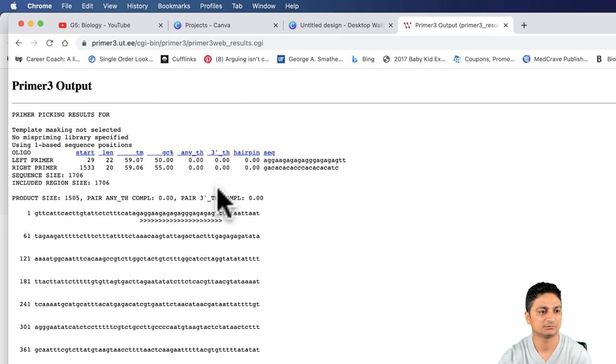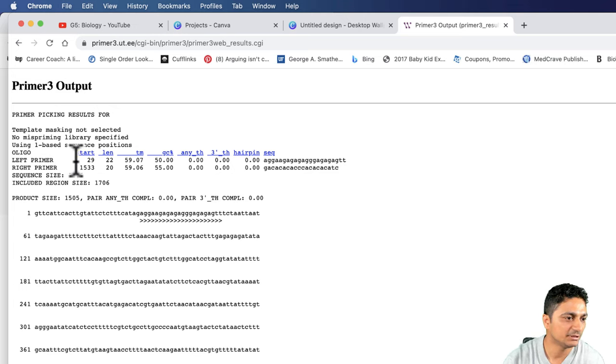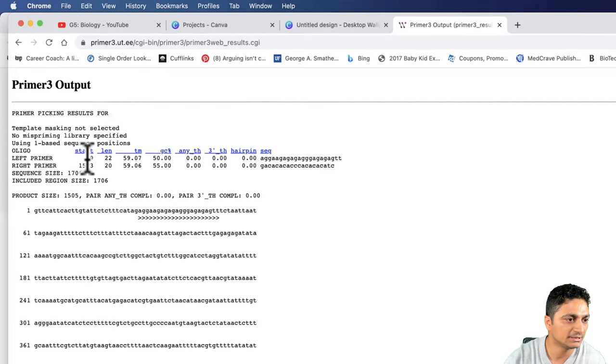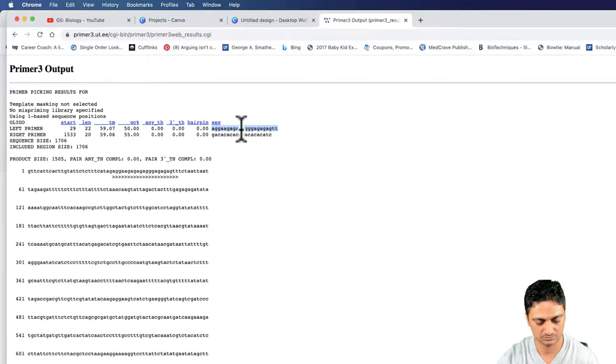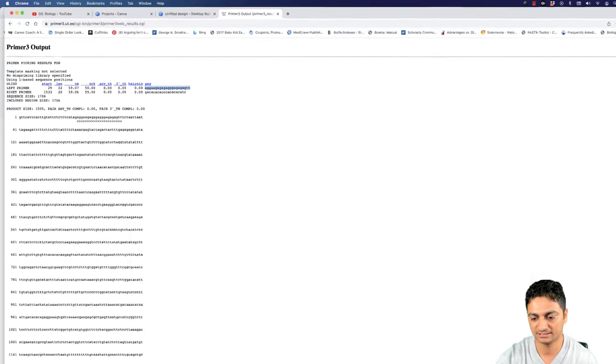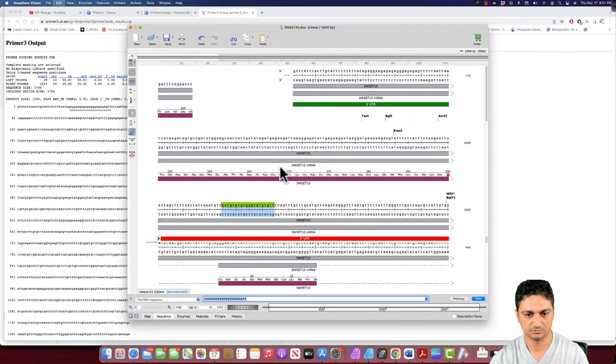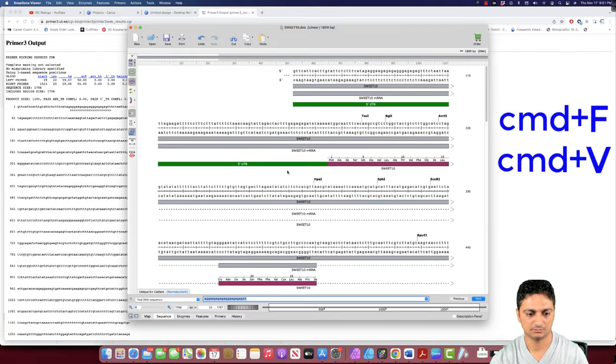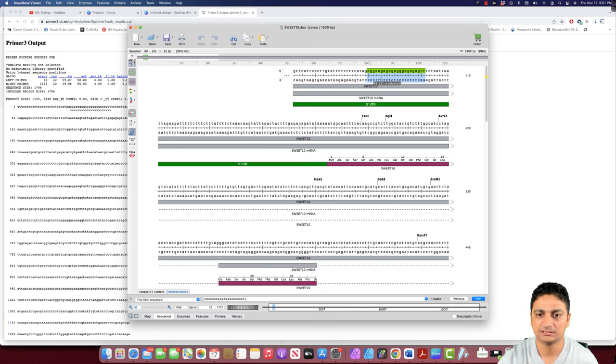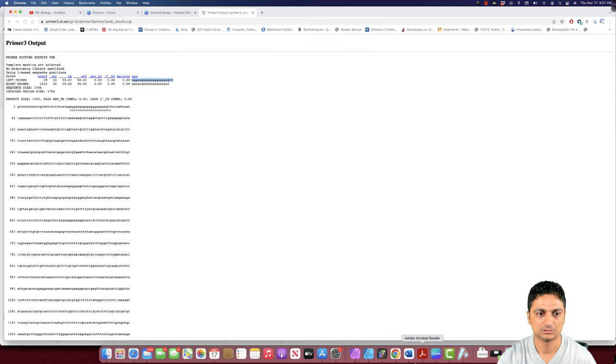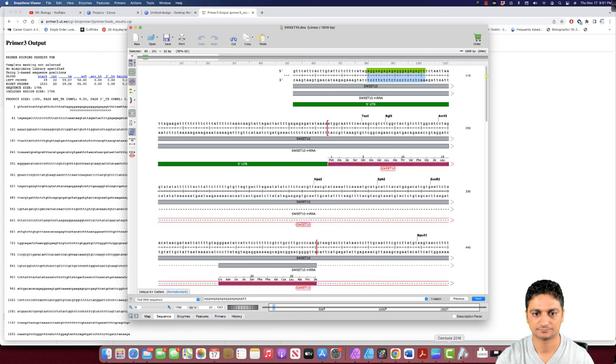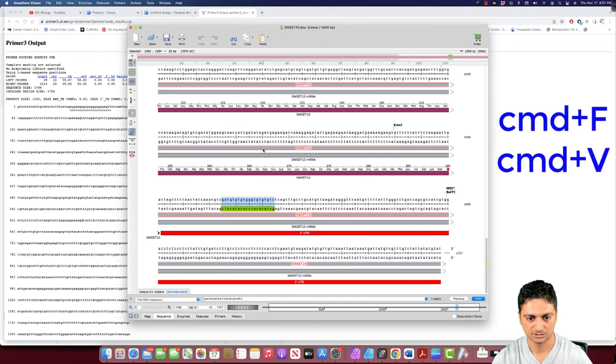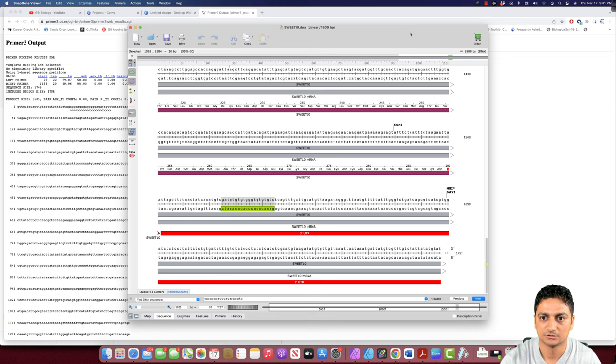Looking at here, we got the forward and the reverse primer. The forward primer is at 29, starting at 29. I think this is going to work for us. I'm not sure about the reverse, so we'll just go and check it here in SnapGene viewer. Control F, Control V. This is the forward primer we have. Let's check the reverse primer also. This is the reverse primer we have. Reverse primer is also in the UTR region. This is going to work for us.